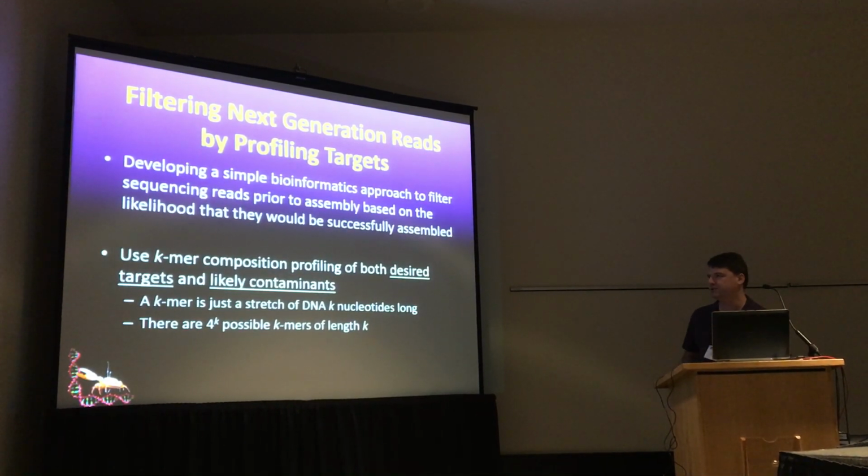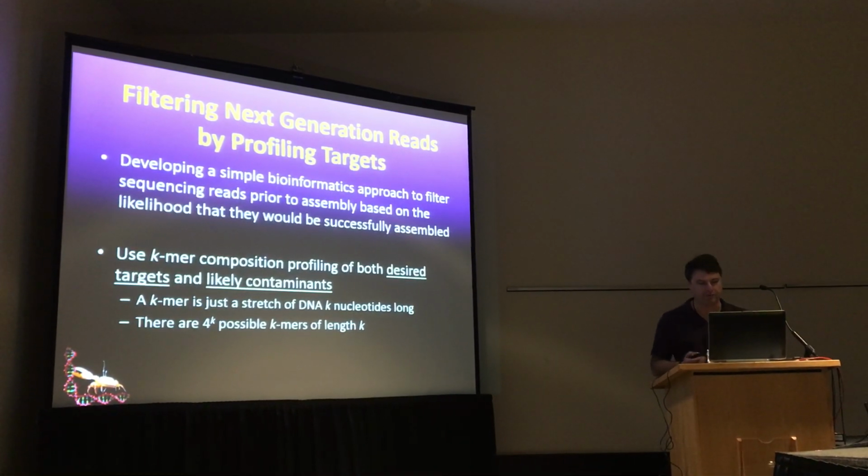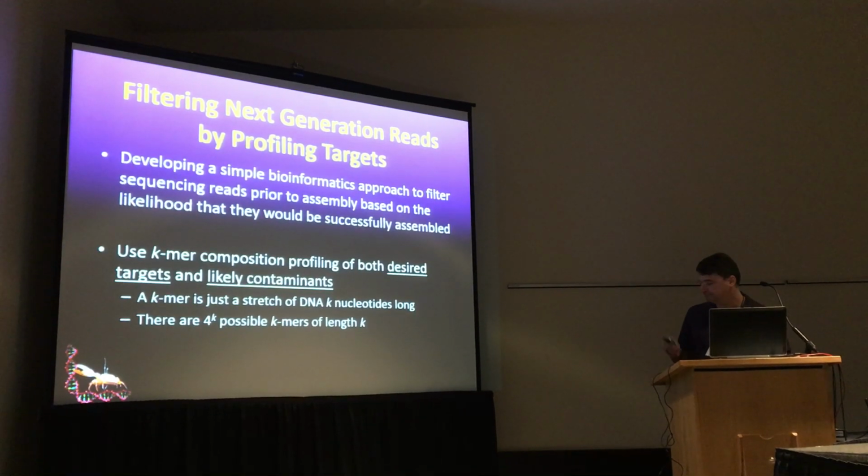This is based on K-mer composition, right? A K-mer is just a stretch of DNA K nucleotides long, and of course there are 4^K possible K-mers of length K.